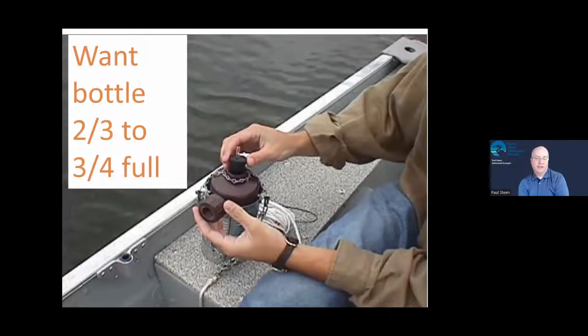You want your bottle to be not full, somewhere between 2/3 to 3/4 full. The reason for this is if you pull it up and it's completely full with water, you can't really know at what point it filled up.